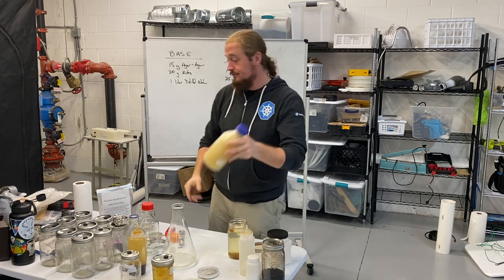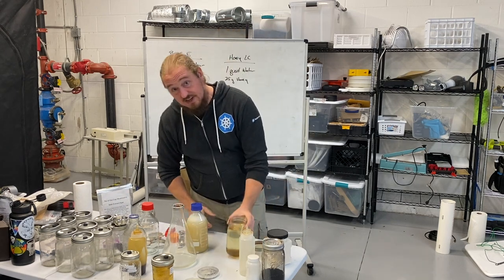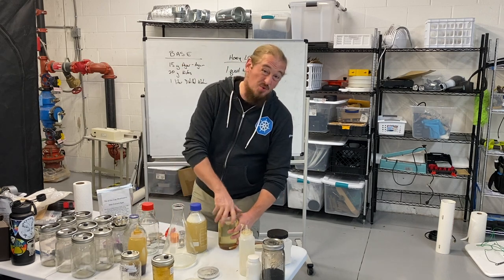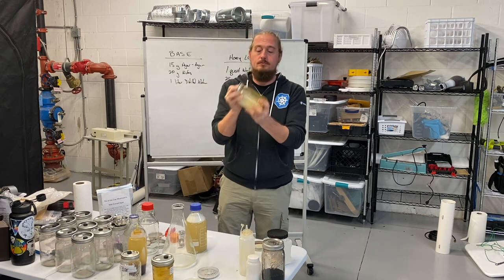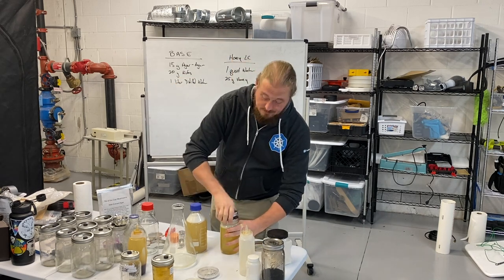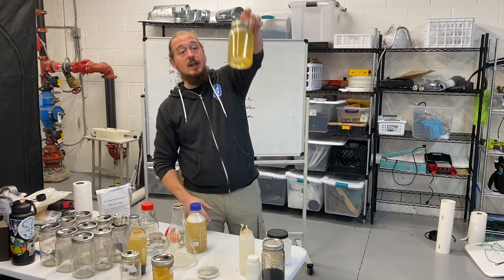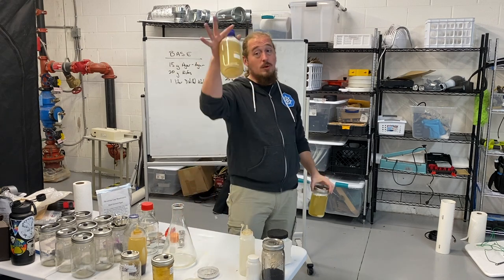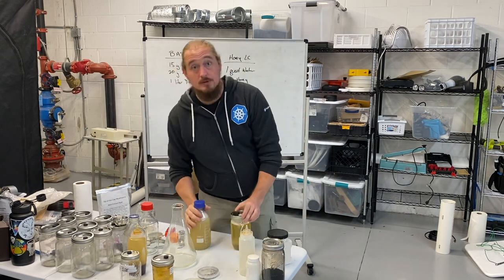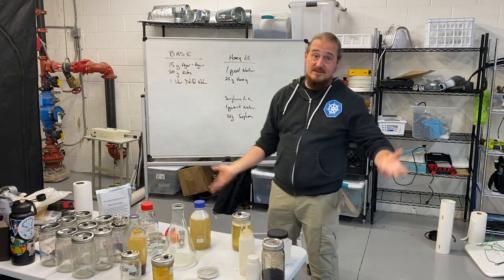Done. Now I'll show you how to put this in the pressure cooker later, but this is now ready to go. This LC jar — I'm going to shake it up and put a clean lid on there. I now have one jar of sorghum liquid culture and one liter bottle of malt extract agar ready to go into the pressure cooker. You're going to sterilize both of these for 20 minutes. You don't have to sterilize any longer because it's liquid — it's going to get superheated and sterile much faster than soil and grains.